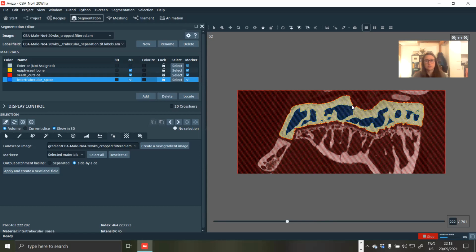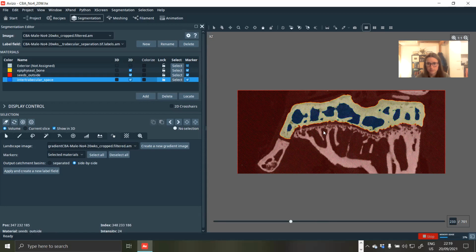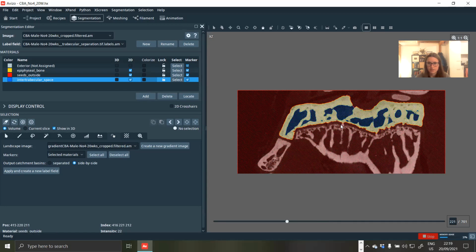We did some sensitivity studies, and even for small specimens like the mice, where the sinuses are pretty big relative to the general region of interest, it didn't make a huge difference in terms of volume measurements in the end. But I suggest you do some sensitivity analyses on your own data set, and consider the questions you're asking, to see whether such cleaning is necessary. Same with cleaning out all these growth bridges. Some of them ended up quite nice, but some of them we cleaned manually.